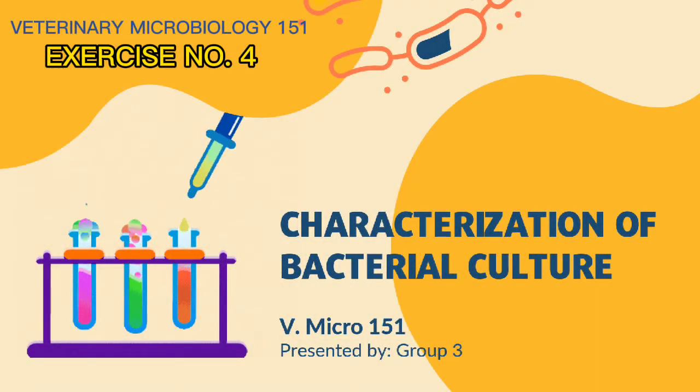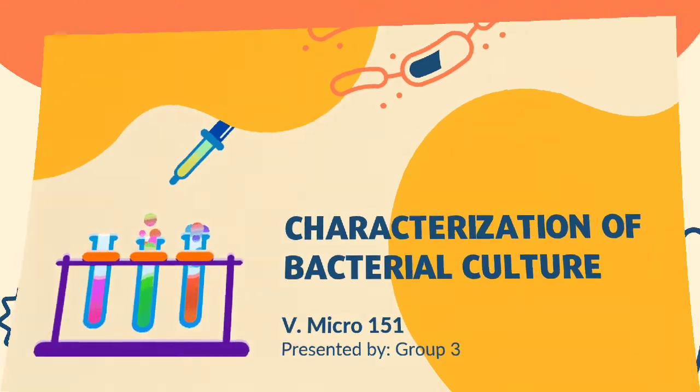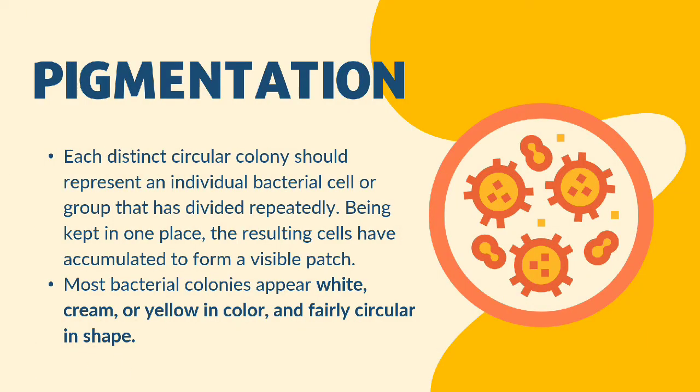Welcome to Veterinary Microbiology 151, Exercise number 4, Characterization of Bacterial Culture, presented by Group 3. For Part 1, we'll be talking about characterization of bacterial culture in agar plates. First, we'll talk about pigmentation.